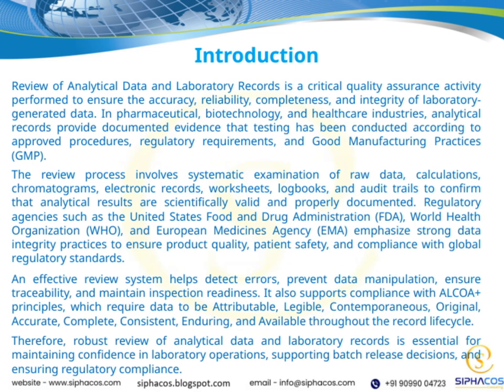The review process itself is quite systematic. It involves carefully examining raw data, calculations, chromatograms, electronic records, worksheets, logbooks, and audit trails. The goal is to confirm that all analytical results are scientifically valid and properly documented. This thorough review supports confidence in our data and helps us meet the expectations of regulatory agencies such as the FDA, WHO, and EMA, all of whom emphasize strong data integrity practices to safeguard product quality and patient safety.